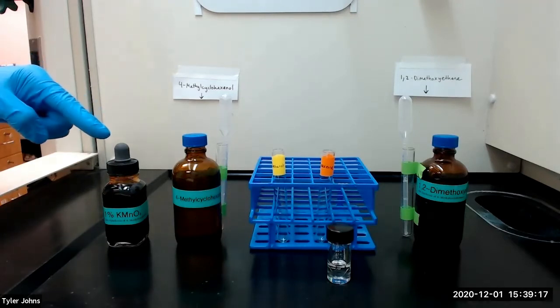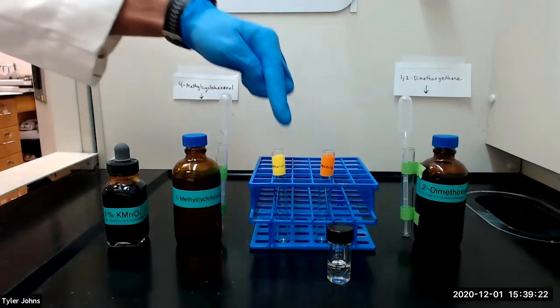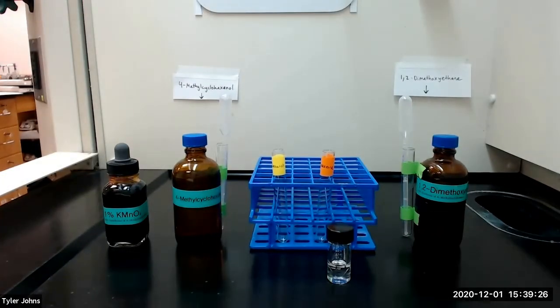We will next slowly add 1% aqueous potassium permanganate solution drop-wise to each test tube. Compounds containing double bonds react with a solution of potassium permanganate, which is purple, to discharge its color and produce a brown precipitate of manganese dioxide.